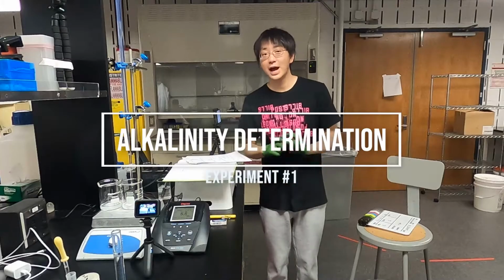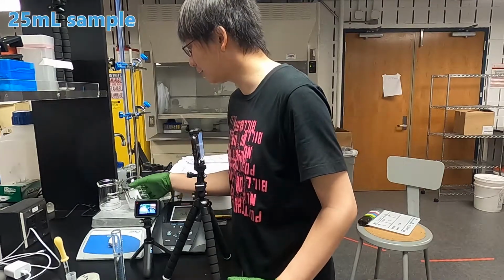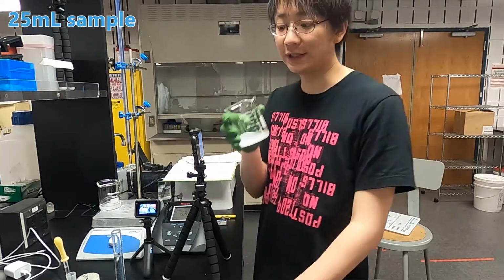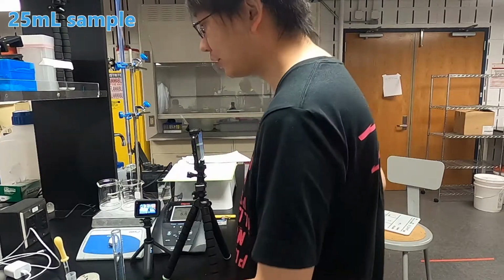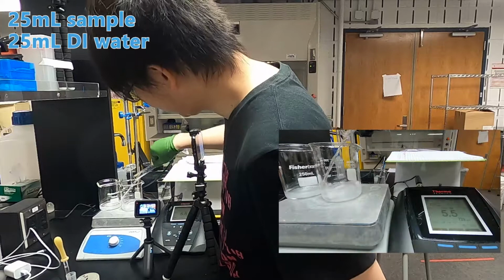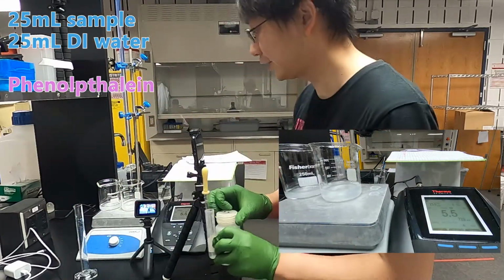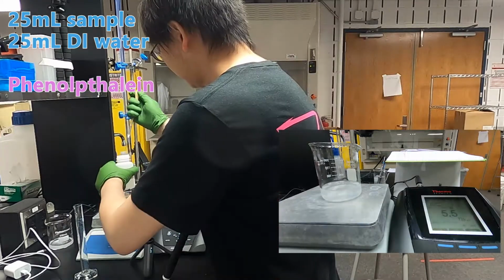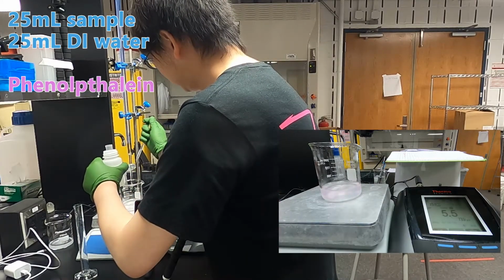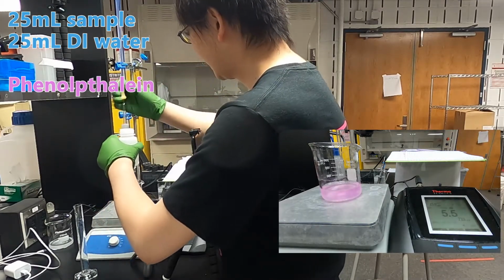So now let's do the alkalinity experiment. First, we have 25 ml of sample in the beaker, and then we add 25 milliliters of DI water into the solution. Then we add several drops of phenolphthalein into our sample. We can see that the solution becomes pink.